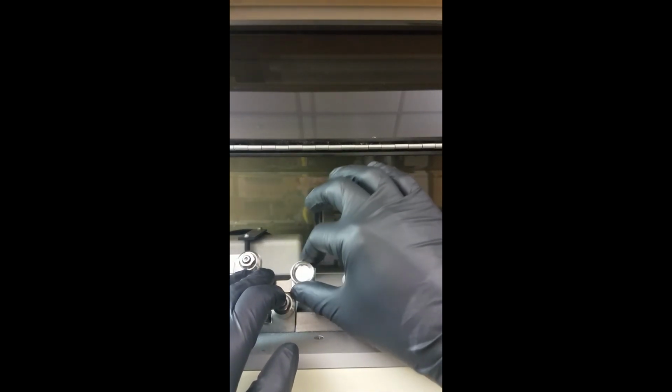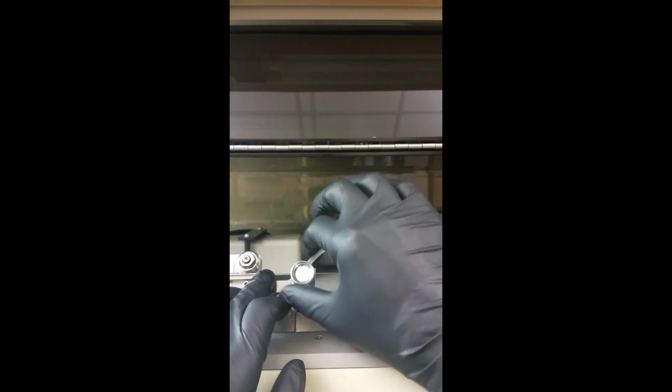put this tube in. You put the glass tube in that track, so that it slides along this track here. You loosen this a little bit, and you can slide it through. Once you get about to the edge of the track, I like to tighten it a little bit. Then right over here you can see there's a little lock. You have to push that in, and then you can slide this whole thing. So you have to push right here, then this will slide.